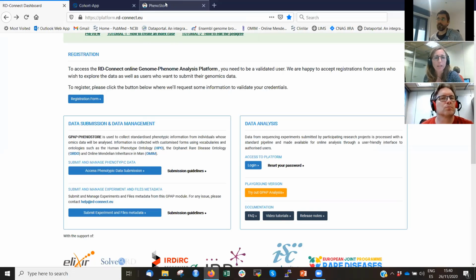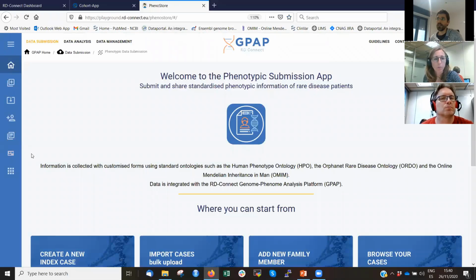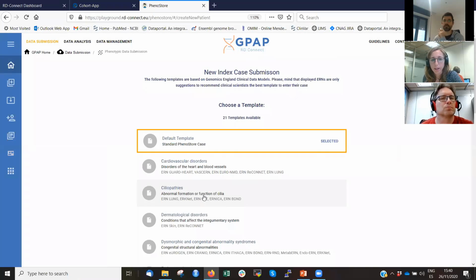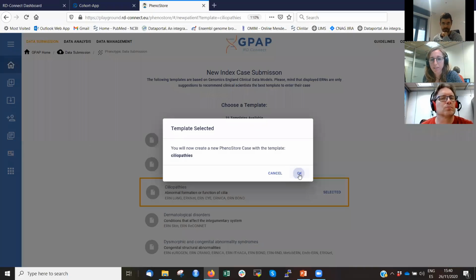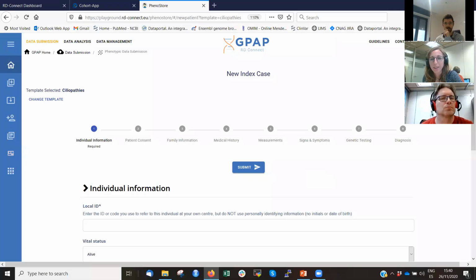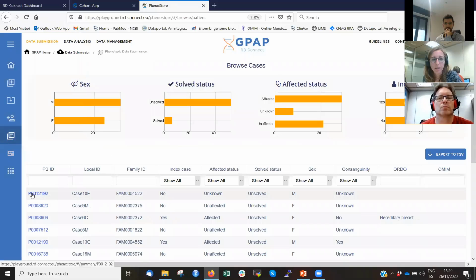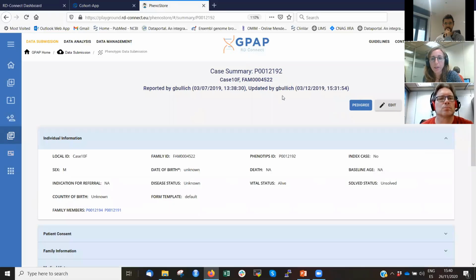Yes. Steve, correct me if I'm wrong, but in principle, once you should have a case open. Yeah, now it's not a case. I will pick a case so that you have the information here.